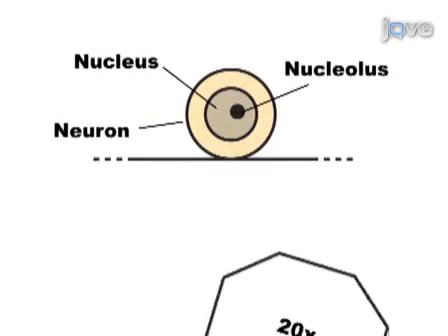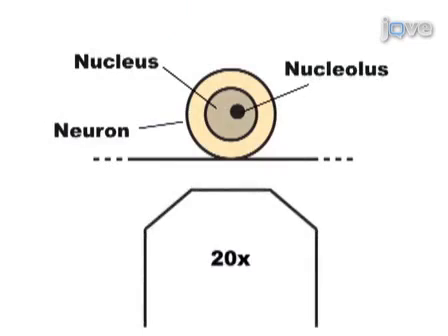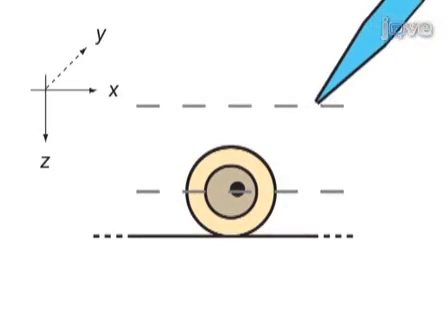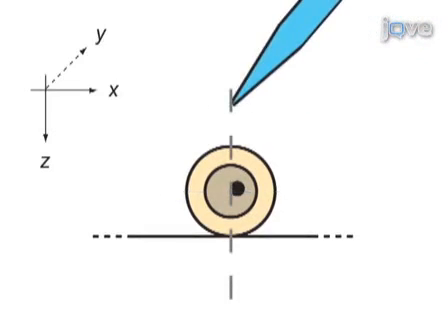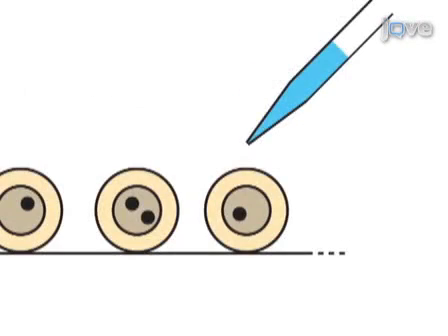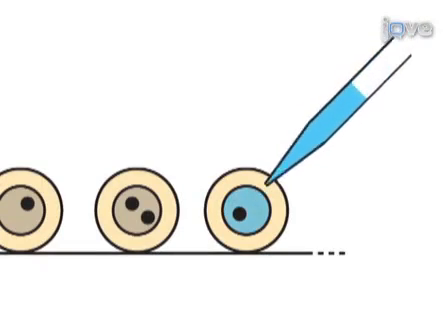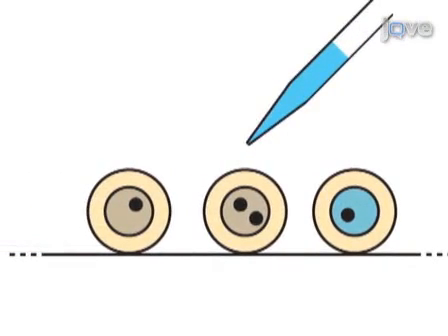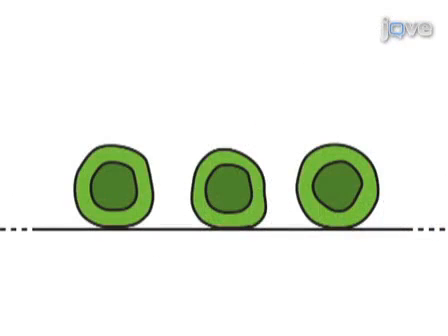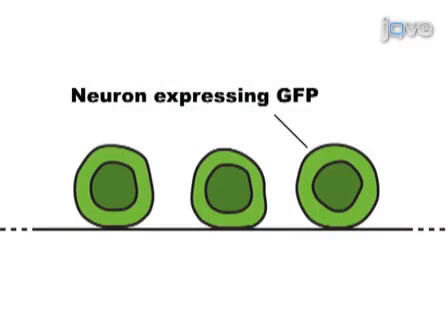Cells are placed on the microscope stage and the visualization of the cell nucleus is optimized. The pipette is aligned with the nucleus and the cell is injected. Multiple cells are injected in each dish. The following day, successfully injected cells are identified by the expression of a reporter gene.